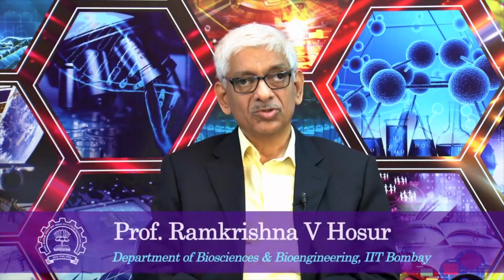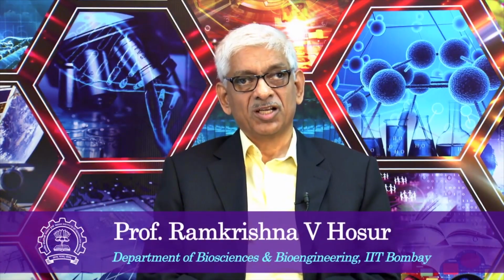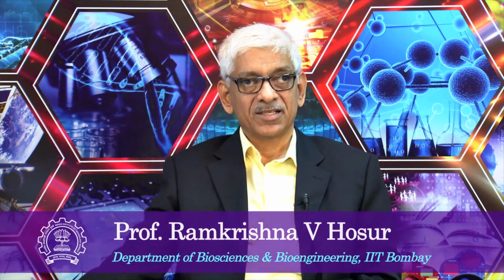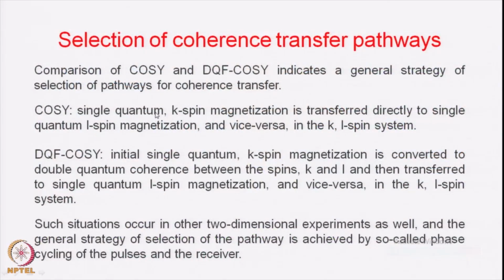So, let us continue the discussion of two-dimensional NMR spectroscopy, and this slide here is a summary of the previous few lectures which you have heard. Essentially it is giving you a concept, the so called selection of coherence transfer pathways. We discussed 3 experiments here, the COSY, double quantum filtered COSY, and also the NOESY, which is not listed here, but we discussed it in the last class.